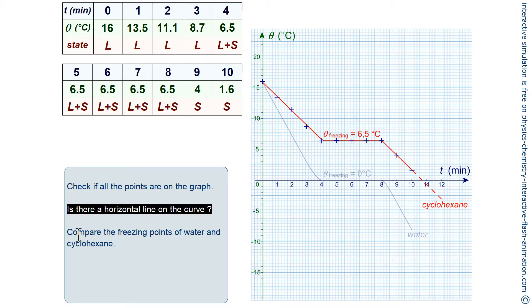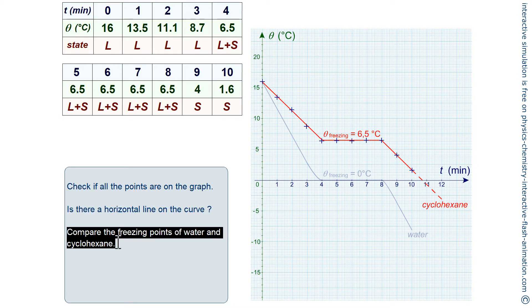Now, is this level the same for water and for cyclohexane? Well no. If water solidifies at 0 degrees Celsius, cyclohexane is at 6.5 degrees Celsius, a positive temperature.